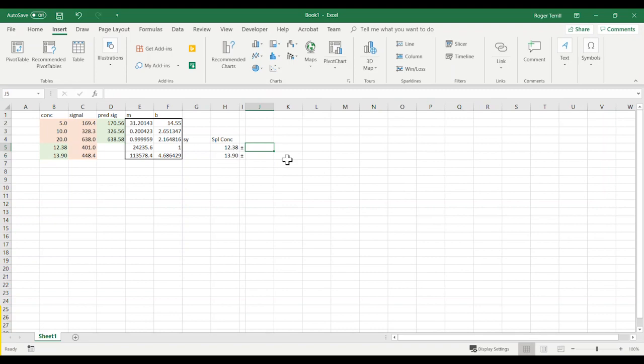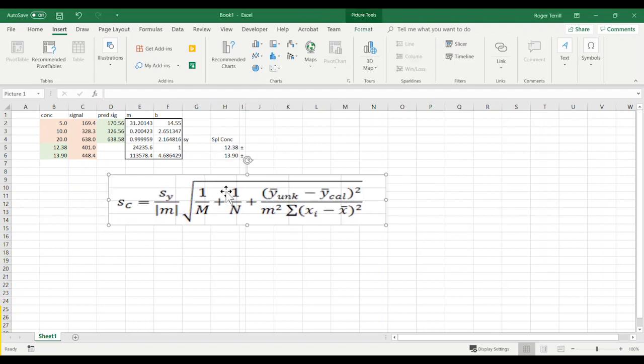Now we need to calculate the uncertainty in this value here, right? This value comes from a calibration curve, right? These data are used to calibrate, and then the coefficients are used to compute the concentrations. When you do this, you need to use a special magic sauce formula, which is actually given in the lab manual, and here it is.